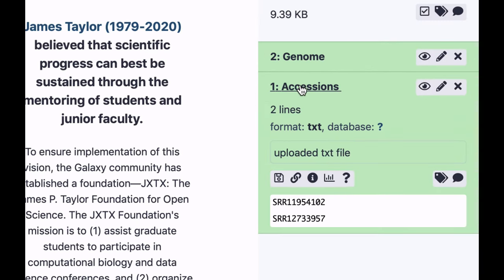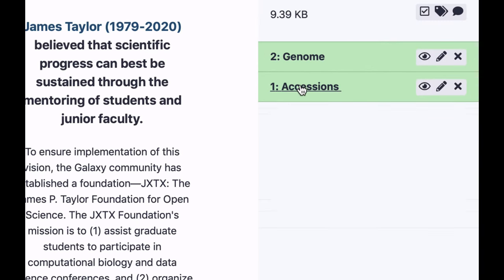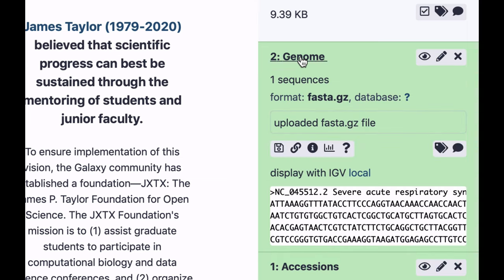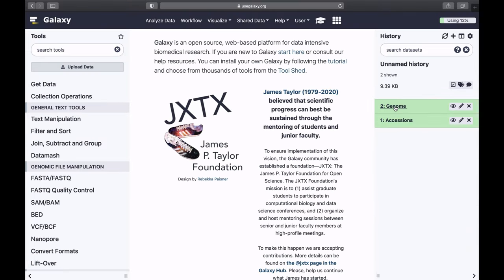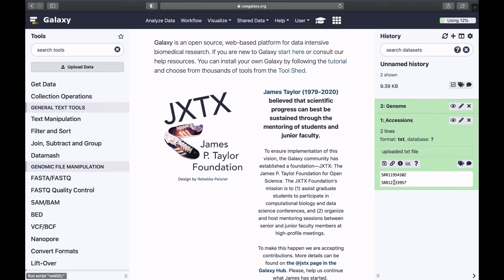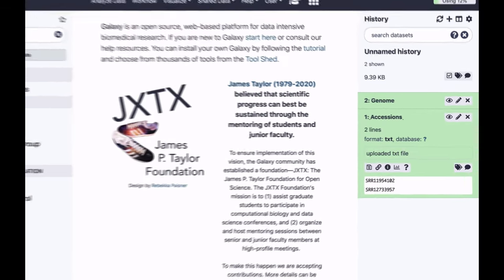Here are our accession numbers, and here is the genome we would like to map against. The first step is to download these SRA datasets from Sequence Read Archive.